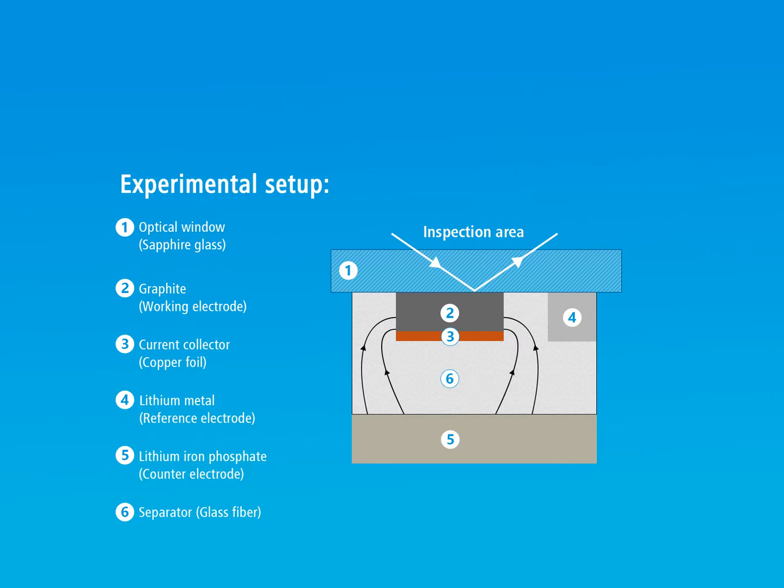Here we present an experiment carried out with the ECC-Opto-Standard test cell showing the color change of a graphite electrode during electrochemical lithiation. The test cell was assembled inside a glovebox according to mode number 3 of the manual.